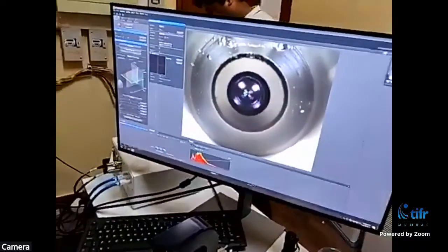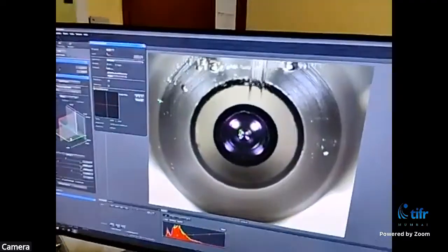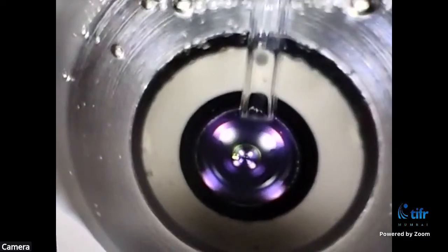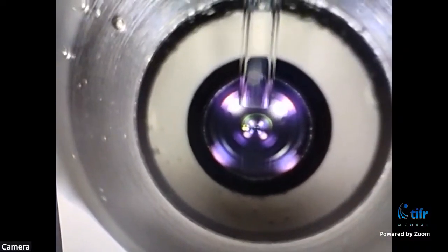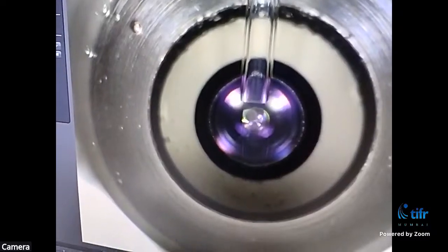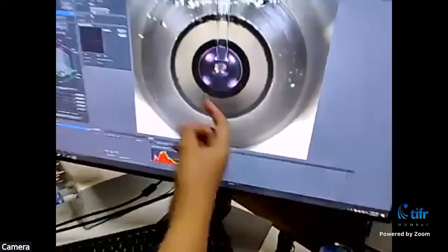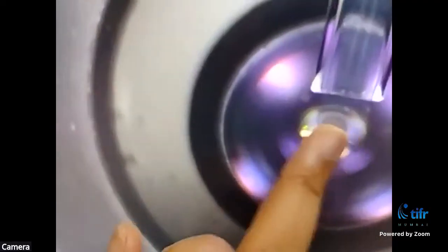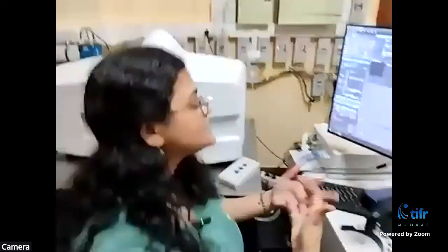And now, like I said, the sample comes from the top. So I'm just bringing it down over here. And you can see that it's there. What we do next is remove the sample from the glass, because glass has a different refractive index. We just need the agarose. And you can see that despite the sample being inside water, it's held stably by agarose. And now I'll show you how it looks when we illuminate it with a wavelength of light using lasers.